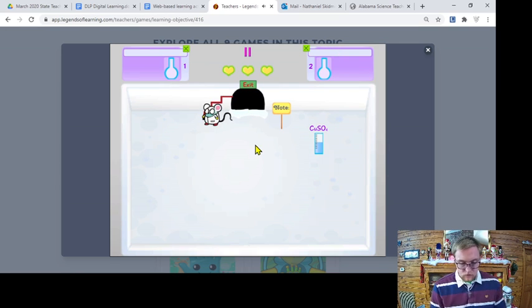Now, before we head over to our exit, let's think about what we just did in terms of our observation guide. Because the key to this lesson is students can complete 2 to 3 copies of this observation guide based on different reactions that they see in this React Lab. We go through one together with our introductory activity where we make our little smiley face or whatever drawing we want out of invisible ink. And that's sort of our way of saying, okay, here's the proper way we can go through this once. Now you're on your own to replicate it.